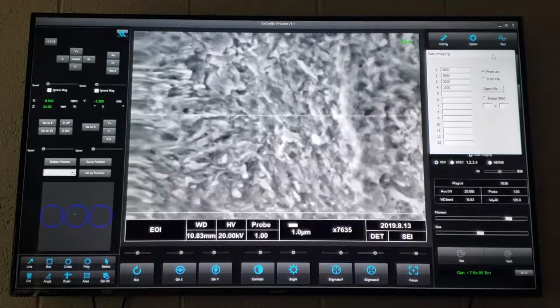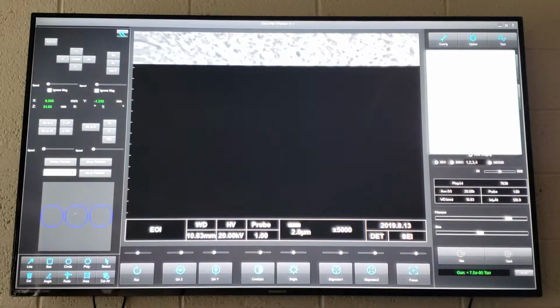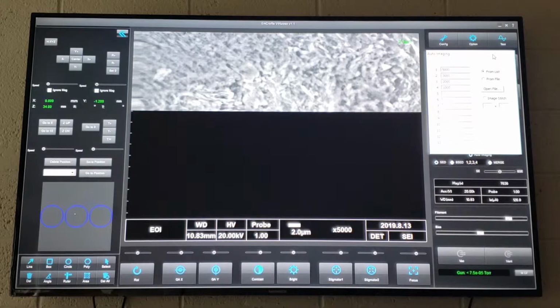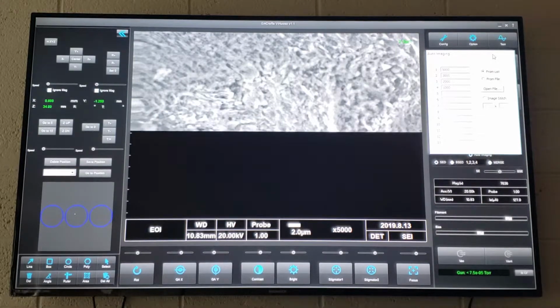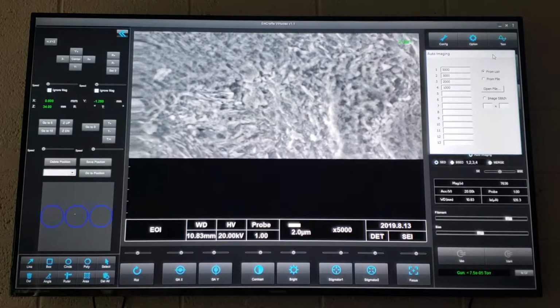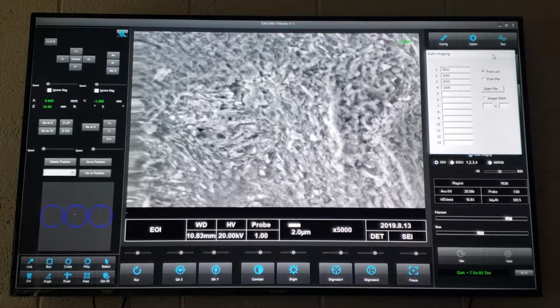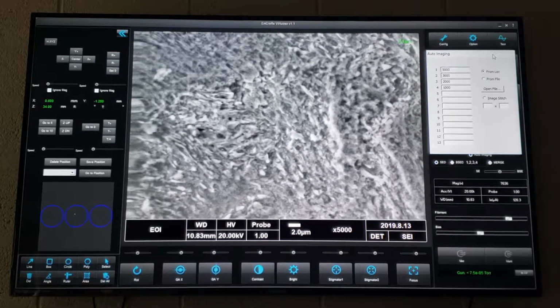Okay. So it wants to go down. Correct. It won't focus going back up. And from the file, is that a text file, an Excel file? If you do from file, you would have to save a file to open the file. So you would have given it a parameter. So you build the list, save it? You could do that. So yeah, it's probably some sort of text file or something. Okay. And so right now it dropped down to 5,000, and now it's going to do 3,000.